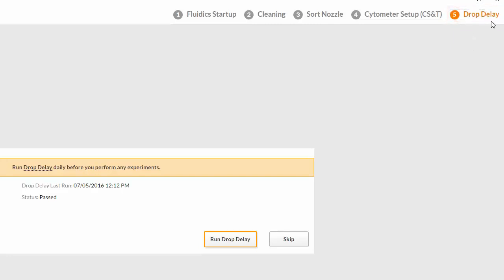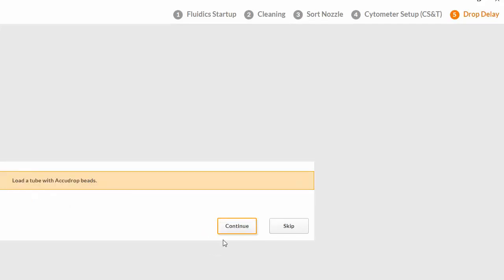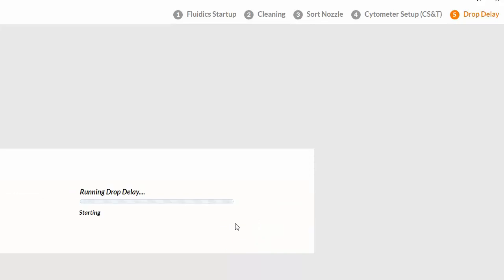The last drop delay run and status are displayed. Click Run Drop Delay and place the beads on the cell sorter and follow the prompts. The system displays the current step with a progress bar.